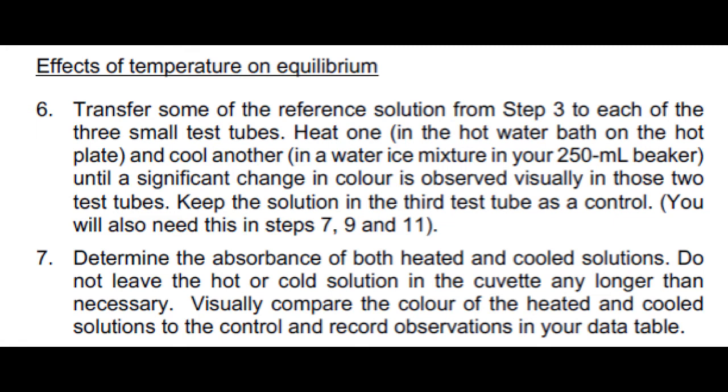Follow the procedure as written for steps 6 and 7, which refer to the qualitative effects of temperature on the observed equilibrium. You'll be heating and cooling samples of your solution, monitoring the change in absorbance observed while heating or cooling.